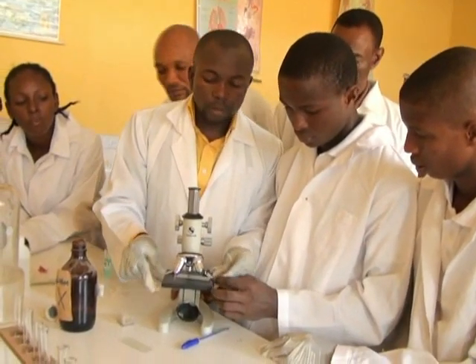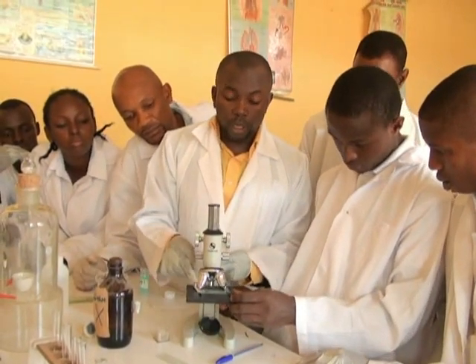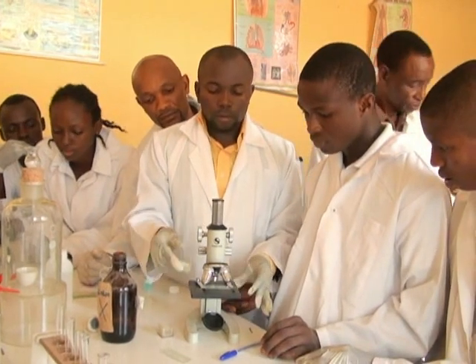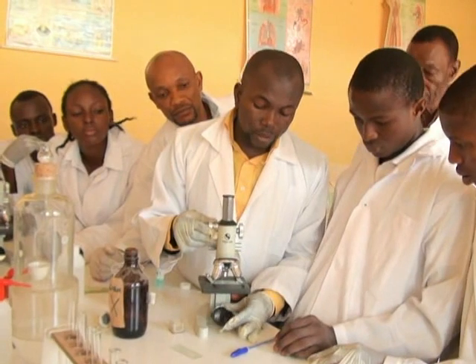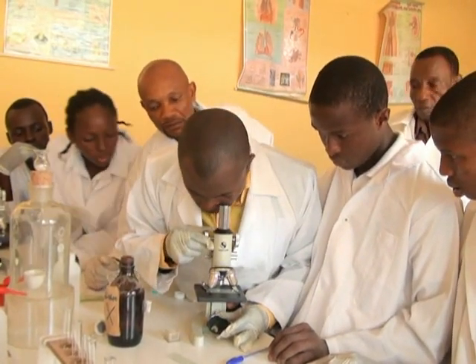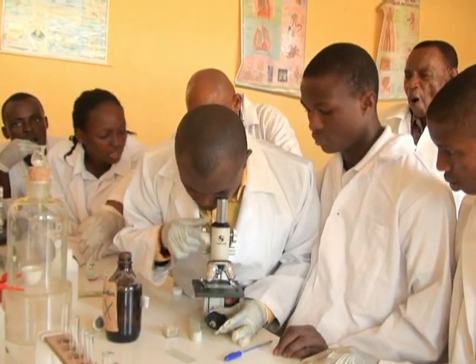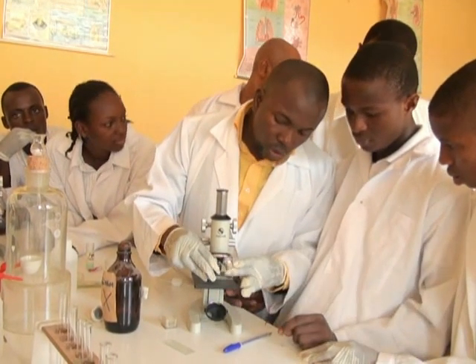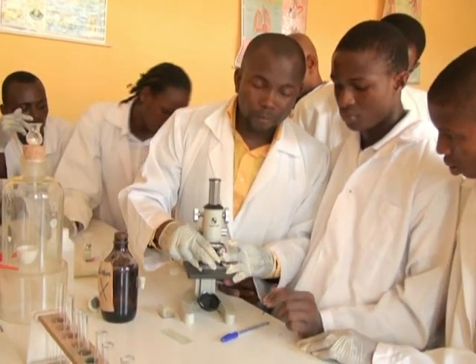As usual, we use the clip to hold the slide to prevent it from wandering. Then we adjust the mirror to provide sufficient light through the hole. Viewing through the eyepiece and adjusting the coarse and fine adjustment knob, we can also swing the higher power.